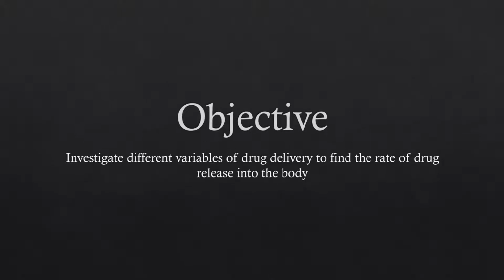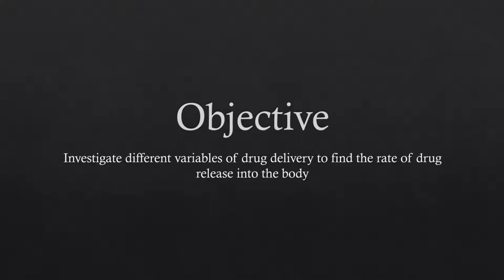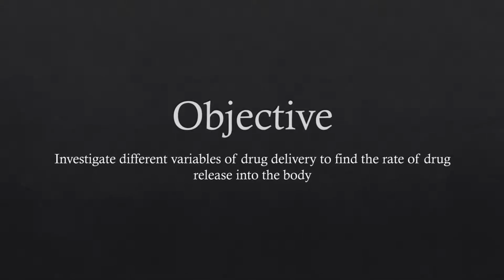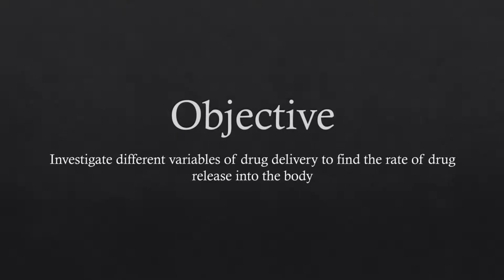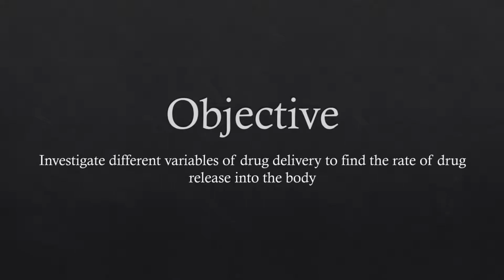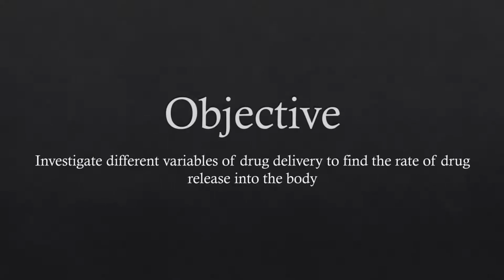The objective in the experiment is to investigate different variables of drug delivery to find the rate of drug release into the body. To simulate the capsule used in pharmaceutical drugs, hydrogel beads were used. Tartrazine dye was used to simulate the drug being delivered into the body.